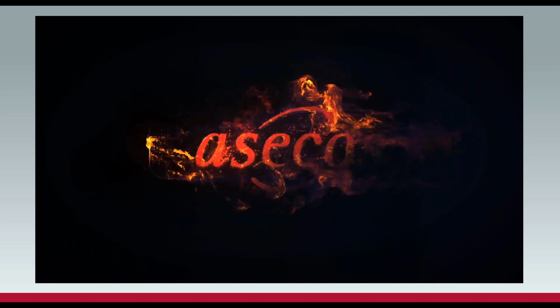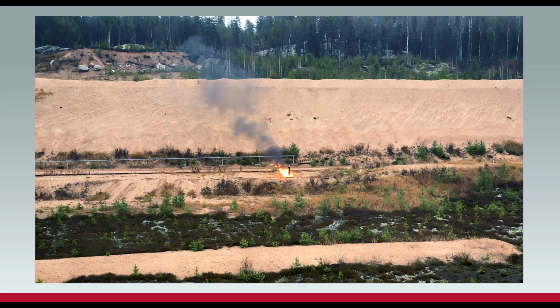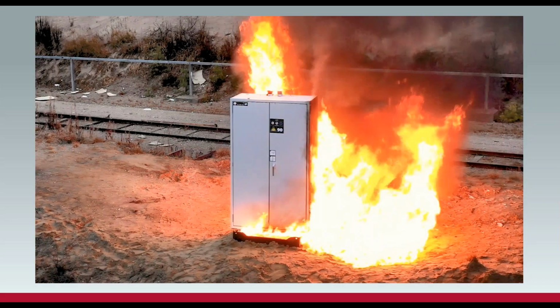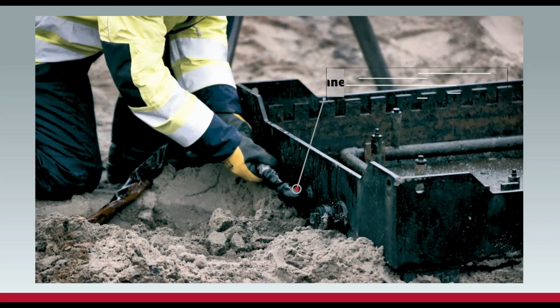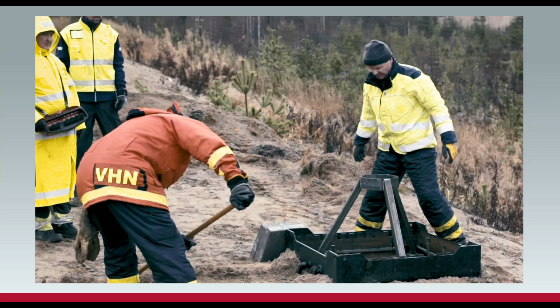And here's a fun video from an Air Force base out in Finland. So everything I've shown you right now that's burnt and had fun, the Germans don't do that in Germany. We go to Finland to do that type of work. I'm not sure why, but the Finns enjoy us blowing stuff up there. Of course this gets nasty, so they've got us way out in the back corner. But quite interesting here. We're going to blow up a hydrogen cylinder, pretty typical. We're going to burn up an acetylene and an oxygen cylinder, which is pretty typical in welding carts or anything like that.